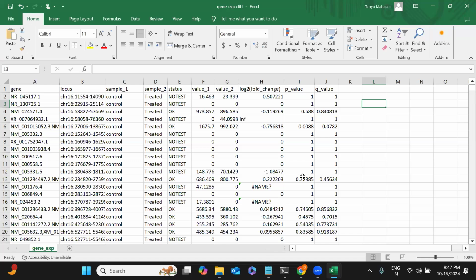Okay. So there are different applications in NGS. It depends on the analysis that we are doing. If what we are doing is genomics or variant calling, that is a completely different thing. But if you want to look at RNA-seq gene expression, we can use the same pipeline. If we are using genomics, it's going to be a completely different pipeline.